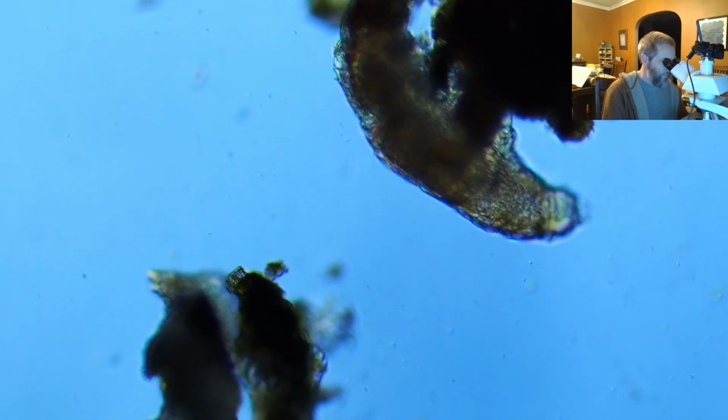In Indiana, which is where I am, here's another water bear, the big one's right there. So that's probably a different species right there. You can see how it's got little fingery things on the ends of its snout. Right there, you can kind of see those, I hope.